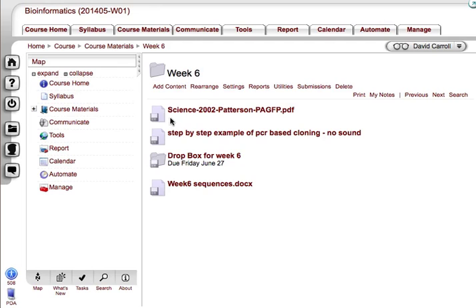At the very top here, we are looking at the Course Angel website, and the very top file is a paper published in Science in 2002 that describes this new vector. It's a very clever paper where they've taken the green fluorescent protein and altered a few amino acids so that it is now responsive to UV light. When you shine UV light on the GFP, it becomes about 100 times brighter. So super cool. It's a neat vector.